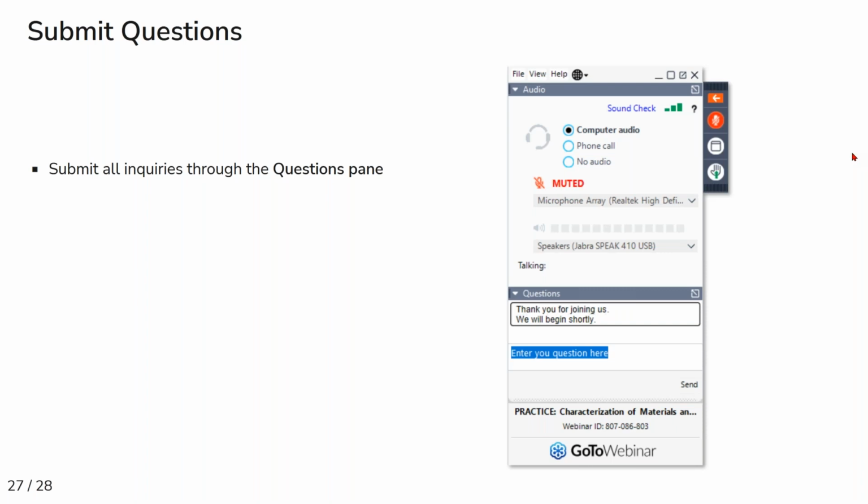There's another question. Is using the gold nanoparticles to label proteins of interest just limited to extracellular proteins, or can it be used for intracellular proteins as well? For the straightforward case, it is somewhat limited to extracellular proteins. There have been some experiments with coating these with cationic substances that allow them to be taken up by the cell. But just as important as getting them into the cell is being able to wash them away, so you get really specific: the only particles that are left are the ones that are bound to a protein of interest.